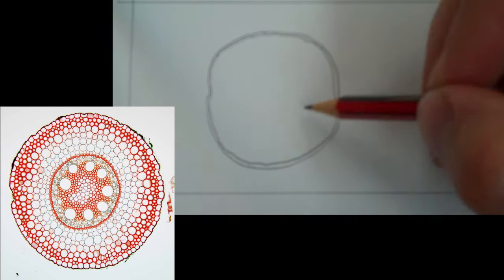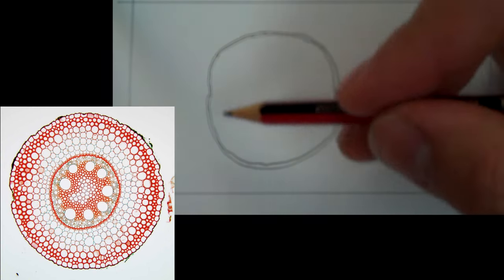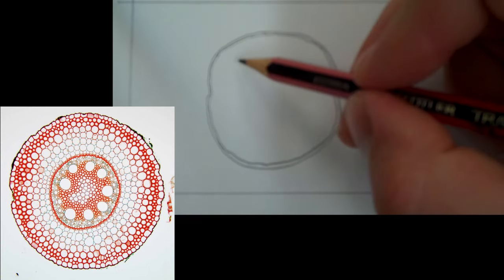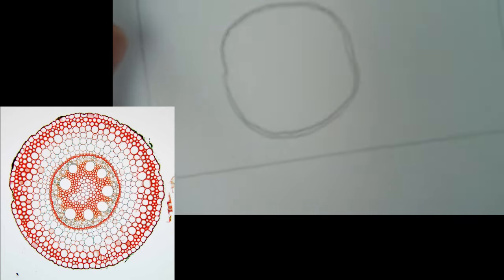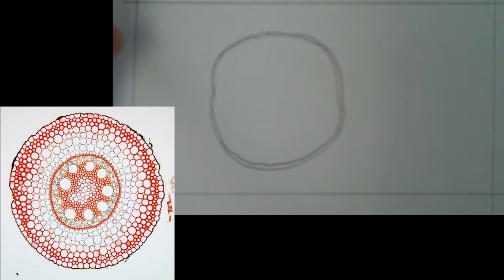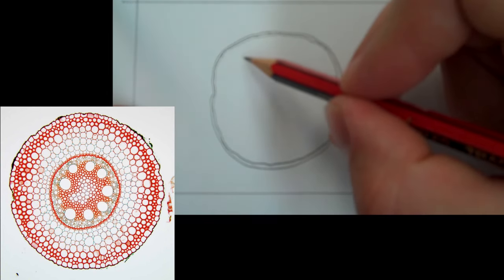Around the outside here, what I can see is there are some cells towards the outer edge which have stained very dark red, and moving towards the center, they're much less stained. Now there is arguably a gradual transition there, so I could do a dotted line, or I could just do a slightly fainter line. But I think there's enough of a division there to essentially just draw a line. So let's do that.